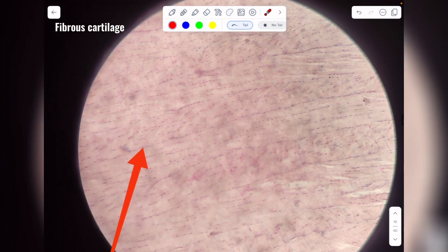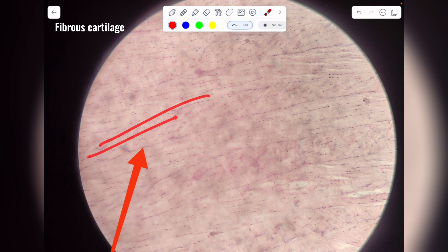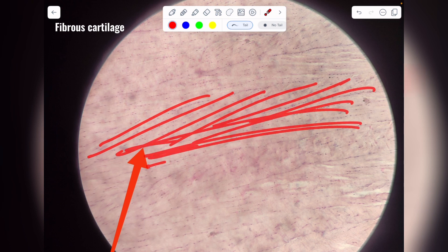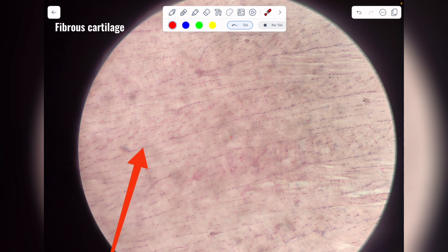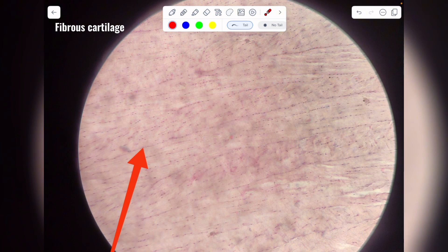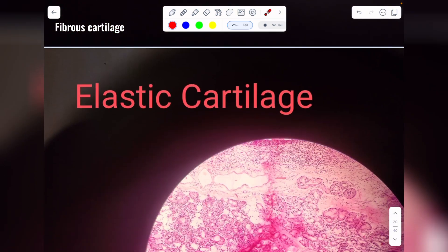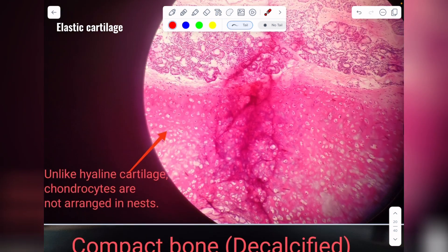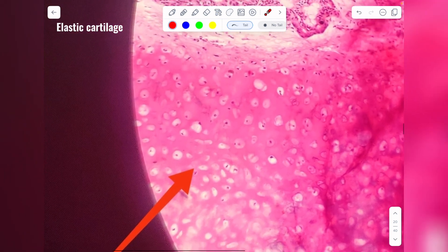In fibrous cartilage, there is large deposition of white fibrous connective tissue. What you see here are white fibrous connective tissue fibers, and on these fibers you can see dots arranged in a streak-like pattern — these are the chondrocytes arranged in a line or chain. So this is your fibrous cartilage.